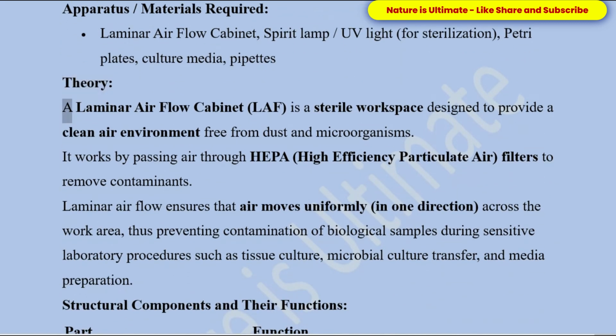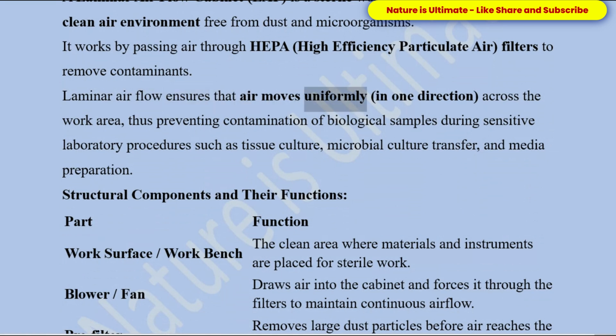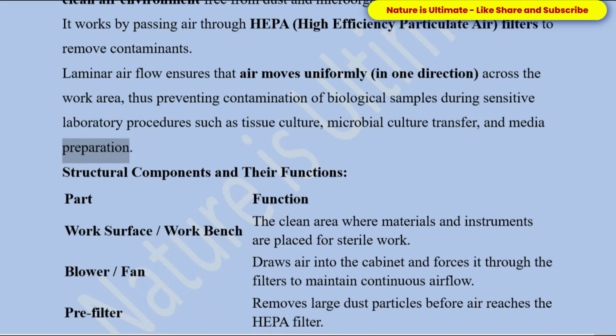Theory. A laminar airflow cabinet, LAF, is a sterile workspace designed to provide a clean air environment free from dust and microorganisms. It works by passing air through HEPA (high-efficiency particulate air) filters to remove contaminants. Laminar airflow ensures that air moves uniformly, in one direction, across the work area, thus preventing contamination of biological samples during sensitive laboratory procedures such as tissue culture, microbial culture transfer, and media preparation.